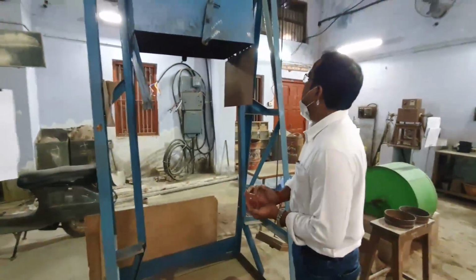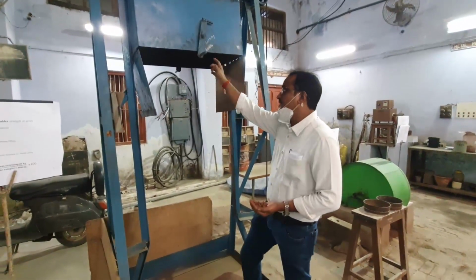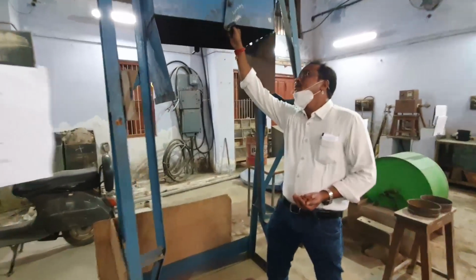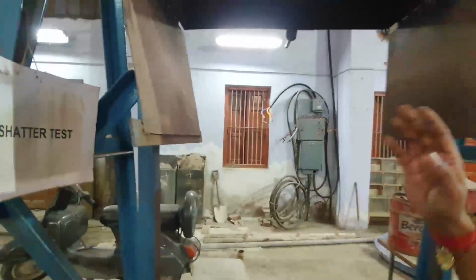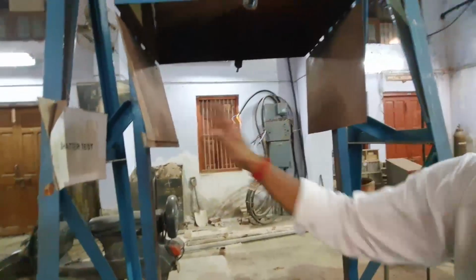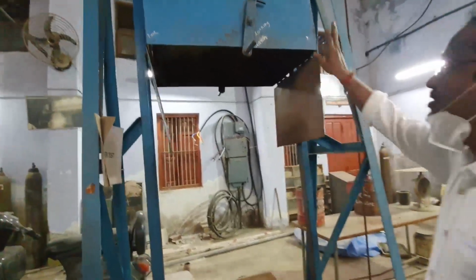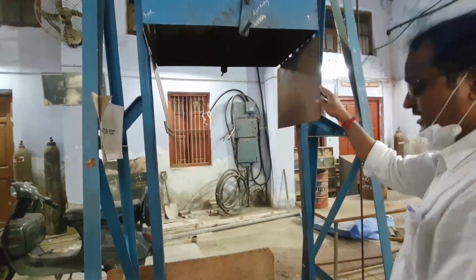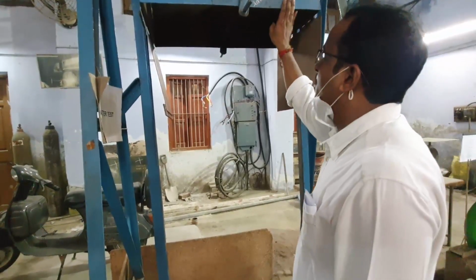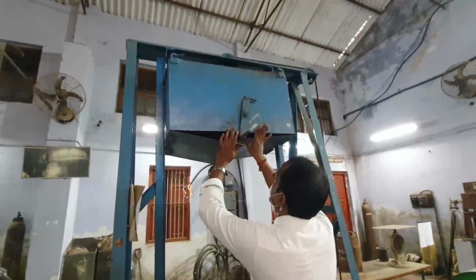Here we are seeing the arrangement. Here a box is there. Inside this box, you can see the top is open. At the bottom we have two halves. The material has to fall from this height. First we keep the material inside, then we open these two doors. That arrangement I am explaining. This is simply one box, top open, and at the bottom we have two halves like this.